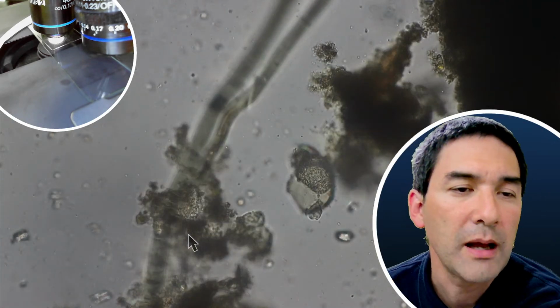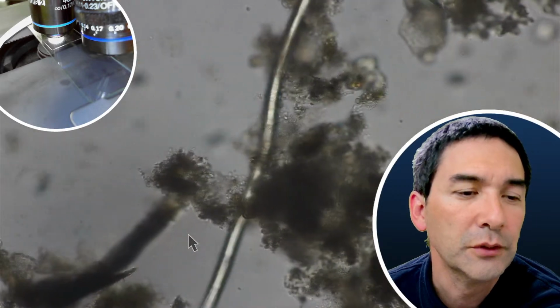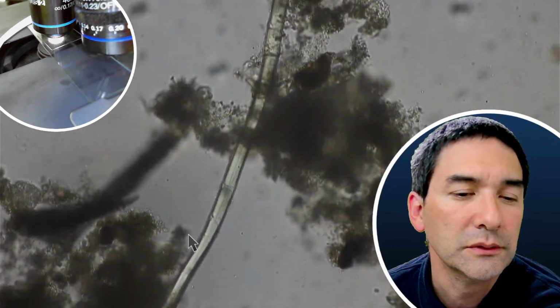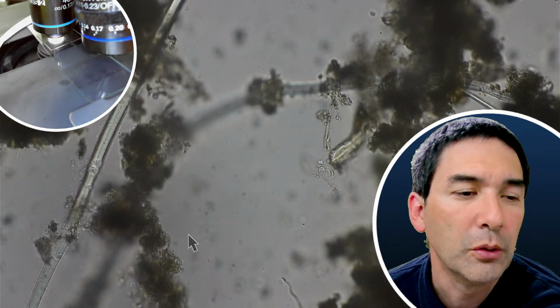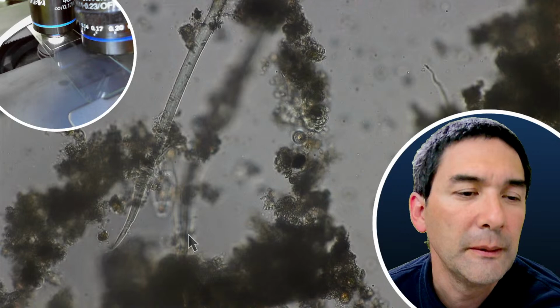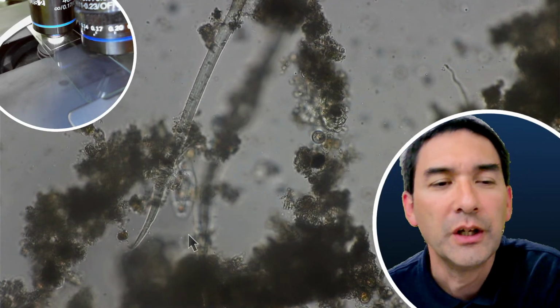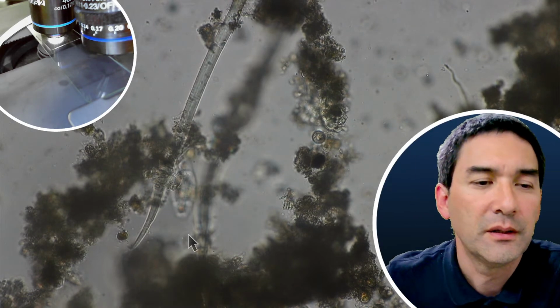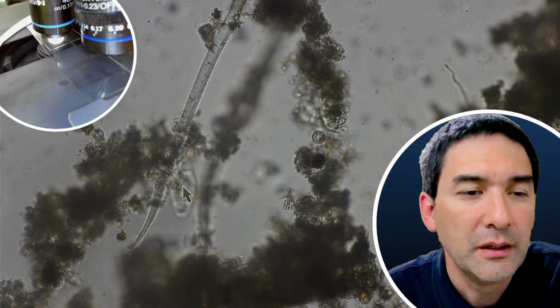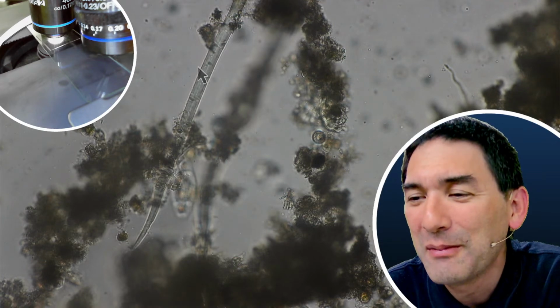So it actually tapered off, just like hair or fur. It's also pretty long here. Yep, here it kind of tapered off. So I do suppose, I'm not entirely sure, that this is indeed fur. Yeah, but I'm always willing to learn new things, and maybe it's something else.